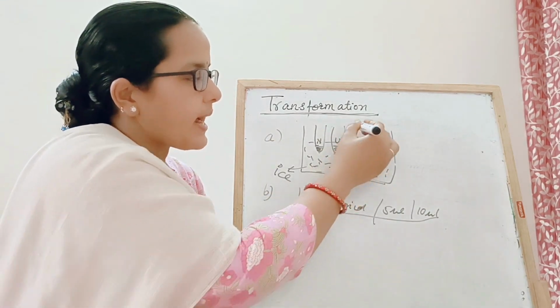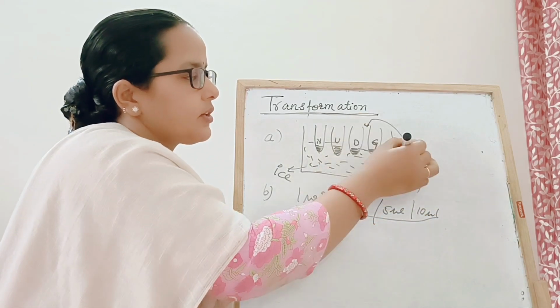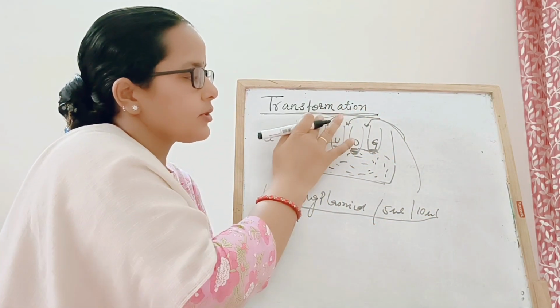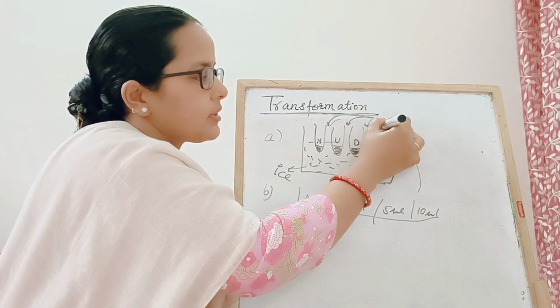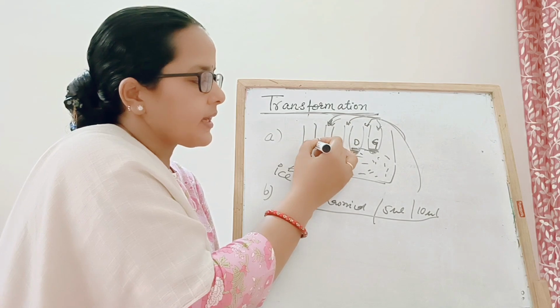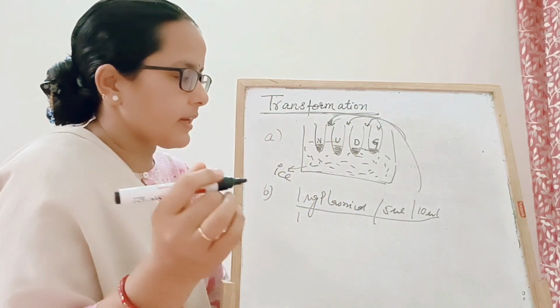So add the plasmid into these tubes, but you don't have to add any DNA in the no DNA vial.